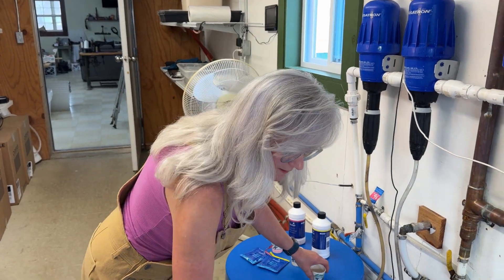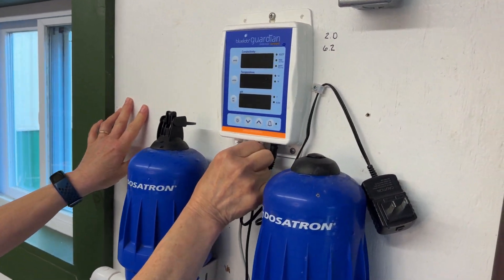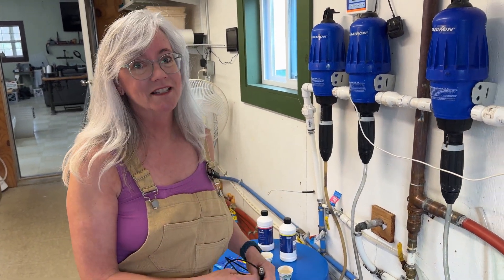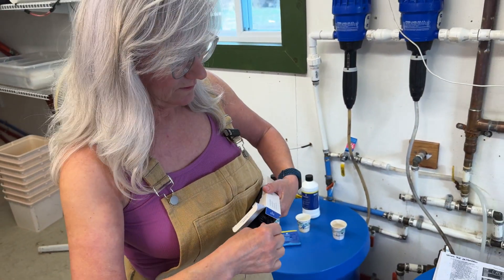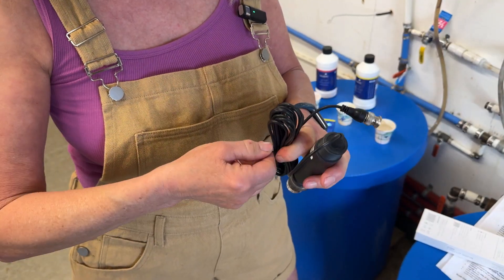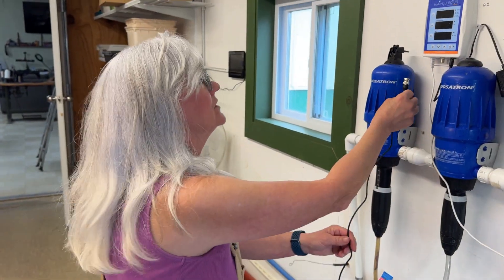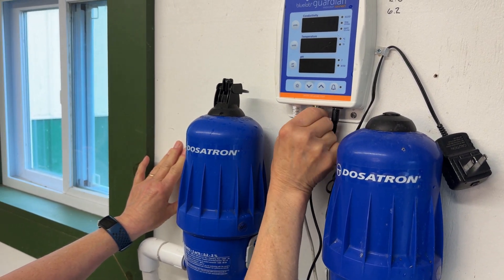I'll rinse them off a little bit, then unplug the Guardian and unscrew the connection. Luckily I was fortunate enough to have an extra one in stock, so I can replace it today. I went to my parts cabinet and here's my new probe. I need to open it up — and see, it's in its storage solution. So let me get this unwound, hooked back up, and get it calibrated. Attach the new end to the monitor, twist it on. Time to calibrate it.